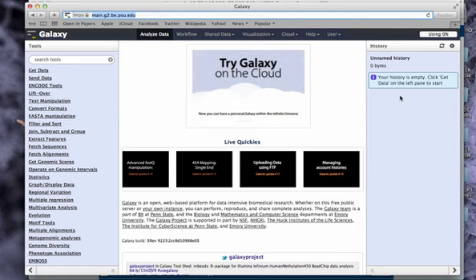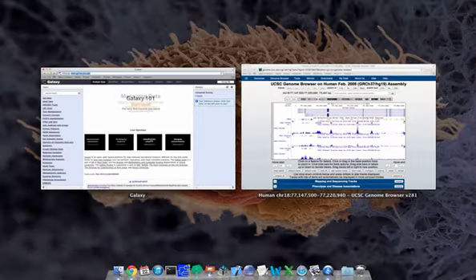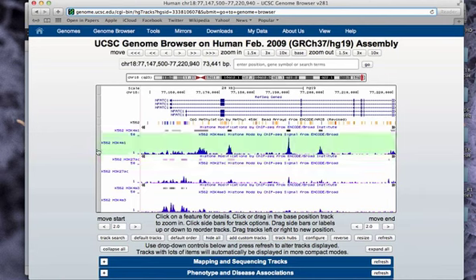So the first thing that we want to do is, in this case, going from where we had K562s, which are a cancer cell line, we want to see if we have marks of an enhancer activated right now, which is K4 monomethylation, K27 acetylation, and not K4 trimethylation.